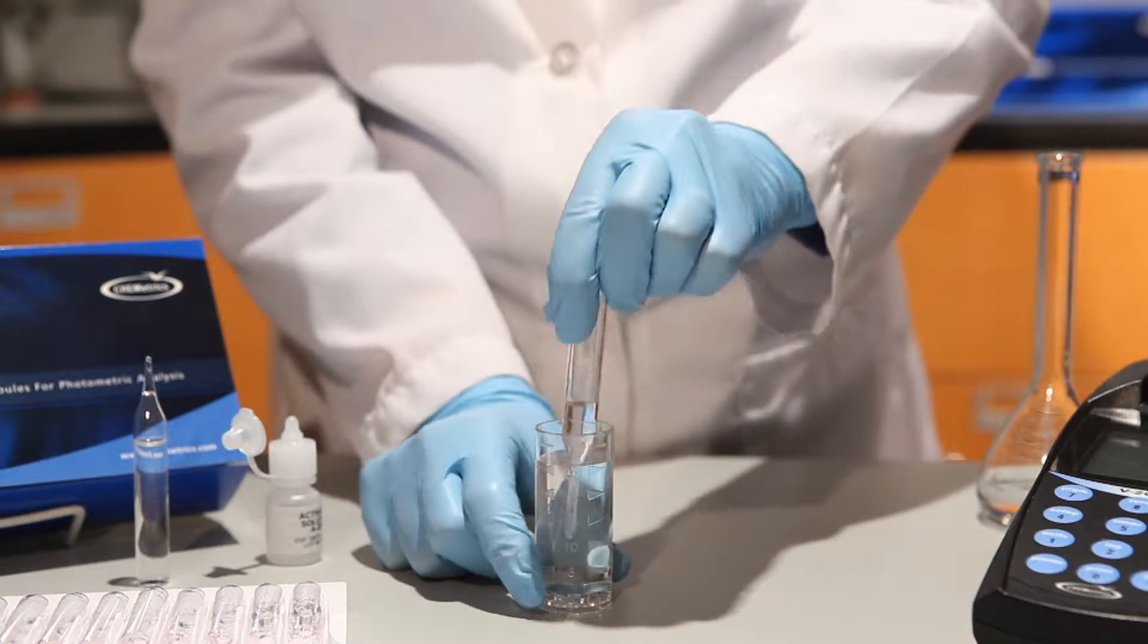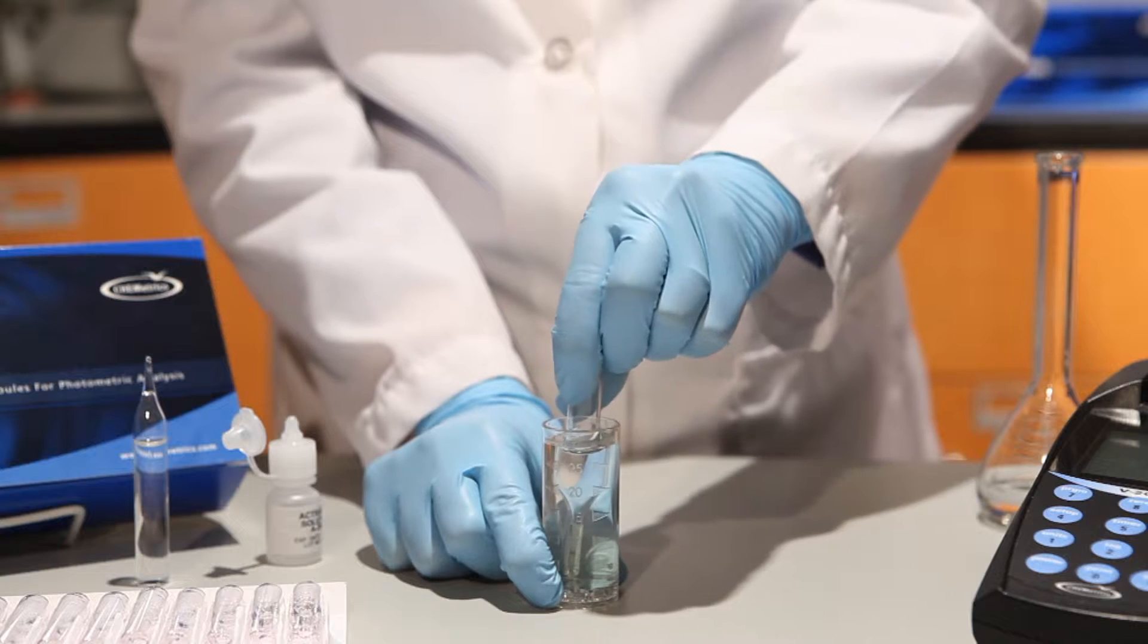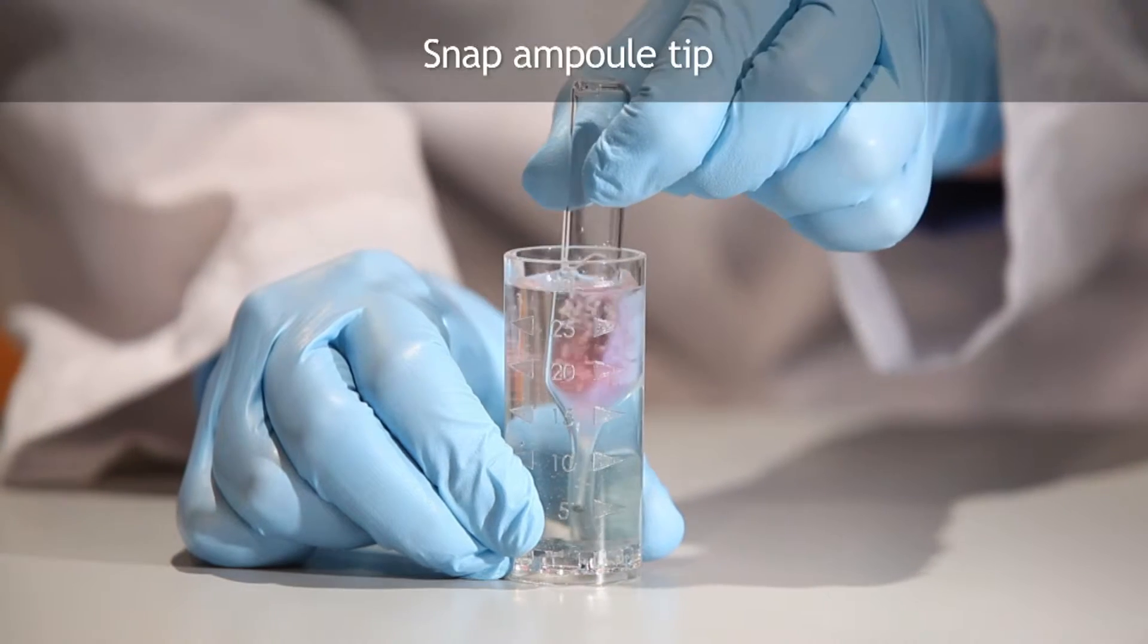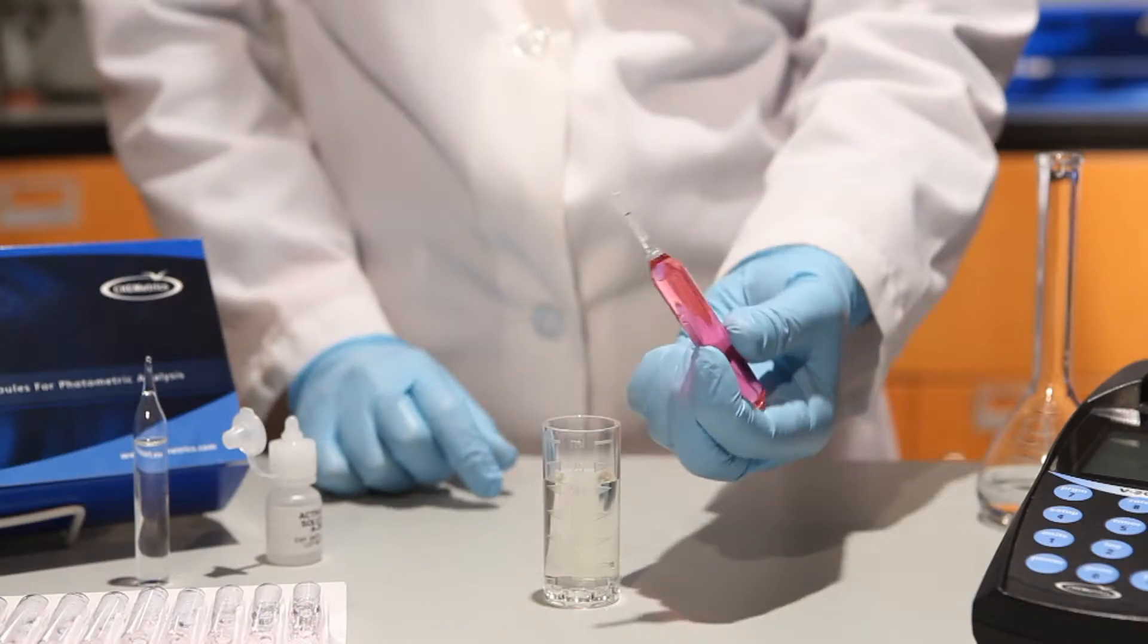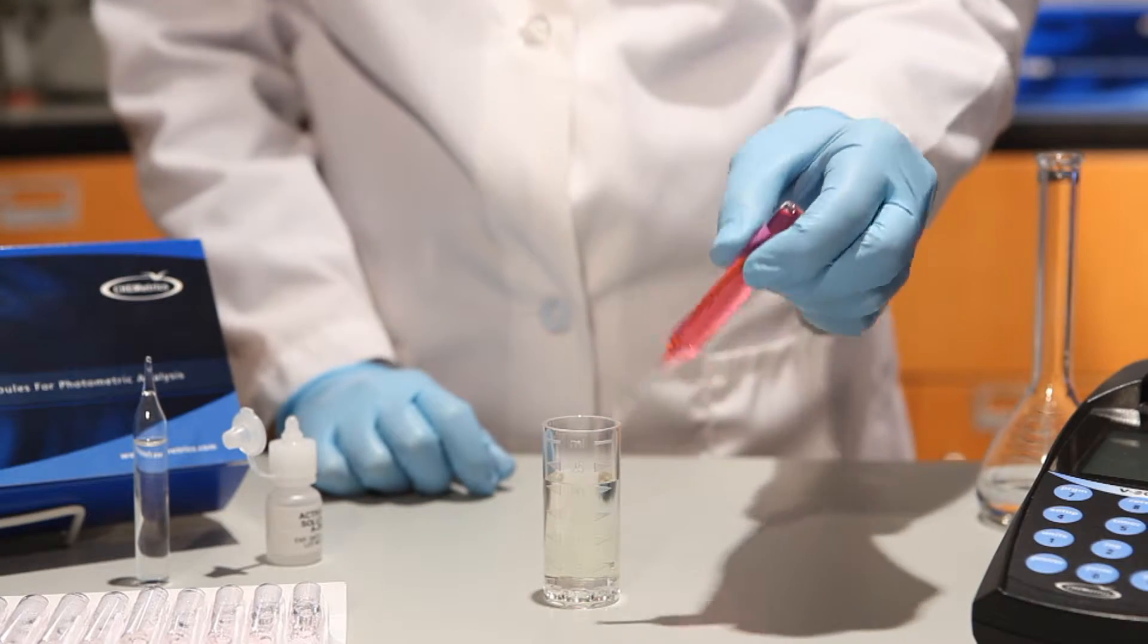Place the Vacuvial Ampule, tip first, into the sample cup. Snap the tip of the ampule by pressing the body of the ampule against the side of the cup. The ampule will fill, leaving a bubble for mixing.